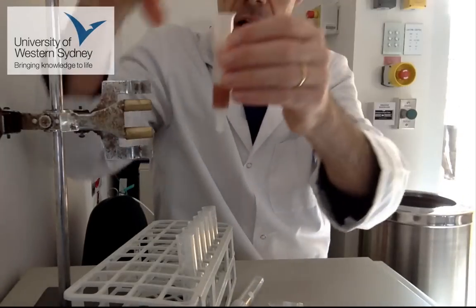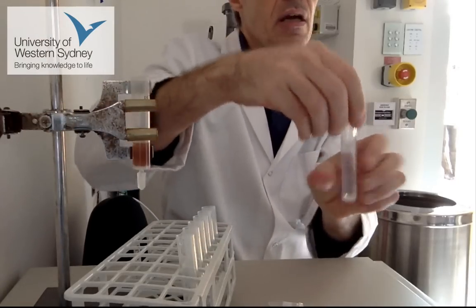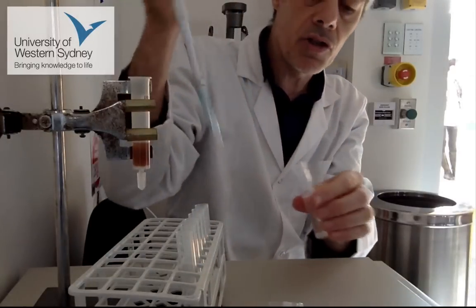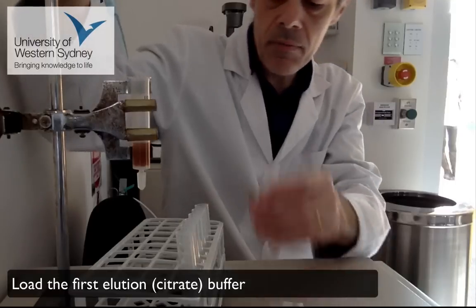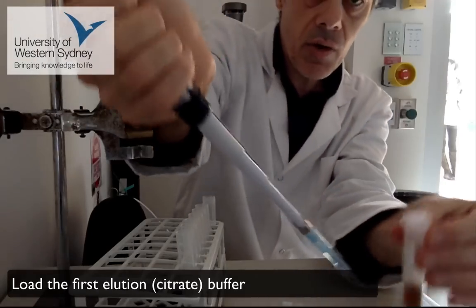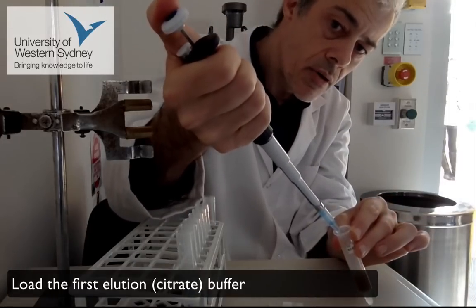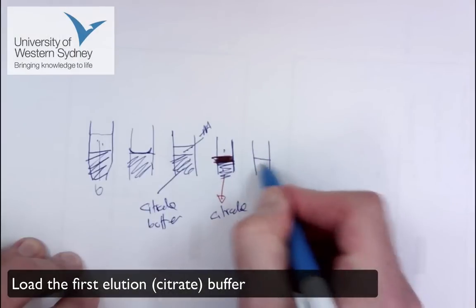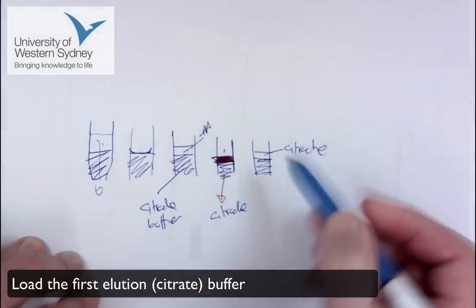Once it's down, flush with the top, you can then take your first buffer, this is my first buffer here, and then you just load the buffer again onto the sample. Again, you're doing it slowly. Maybe I'll just do it when it's in the thing, but I just want to show you that I'm loading slowly down the side. The next thing you do into the column is just a little bit of citrate.